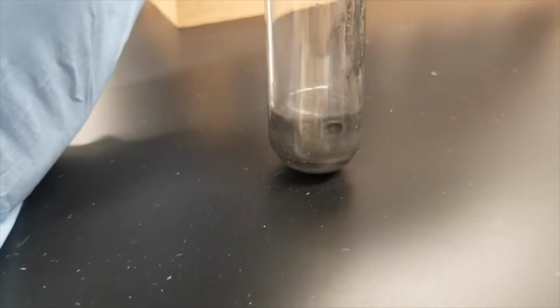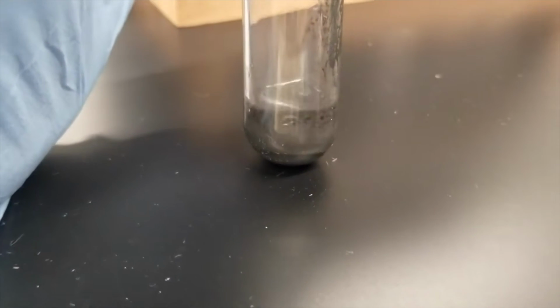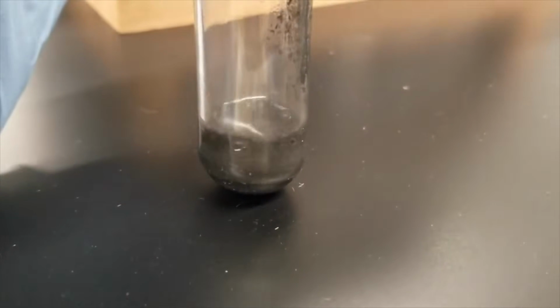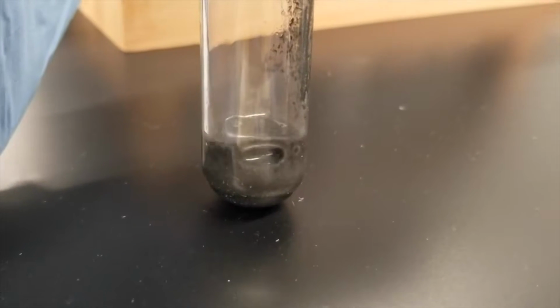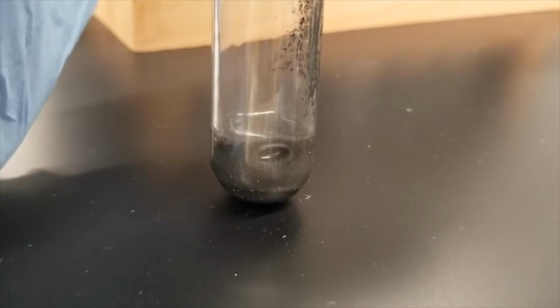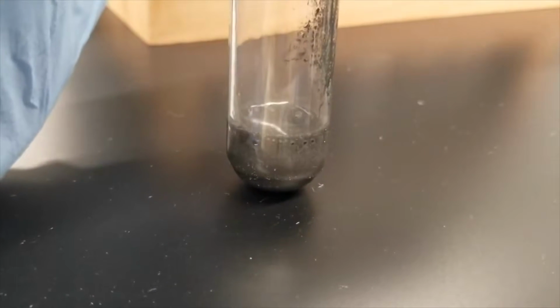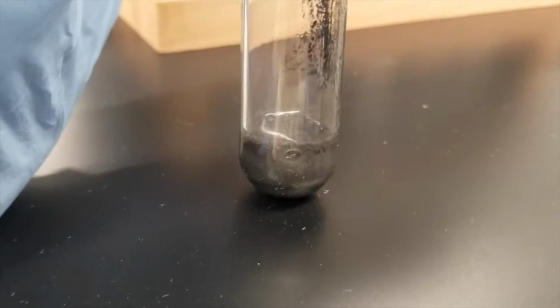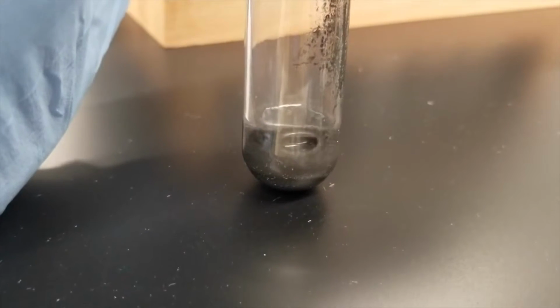Here's a replay of that addition of manganese IV oxide, just a little bit closer up, so you can see definitely there's a significant difference here from our standard, our reference test tube. Okay, so all those bubbles you're seeing are actually bubbles of oxygen gas being produced by the decomposition of hydrogen peroxide into water and oxygen. Notice the vigorous bubbling that we observe here compared to our reference test tube.